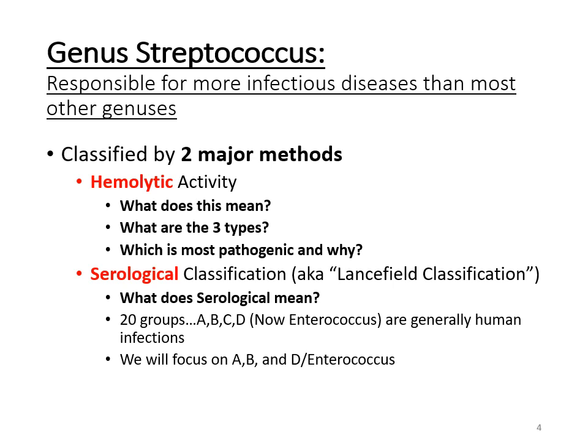Beta hemolysis or beta hemolytic activity is the most pathogenic because that is the complete breakdown of those red blood cells. You kind of need your red blood cells, so that's a problem. The second one is alpha hemolytic activity. Alpha hemolytic activity is only the partial breakdown of the red blood cells.